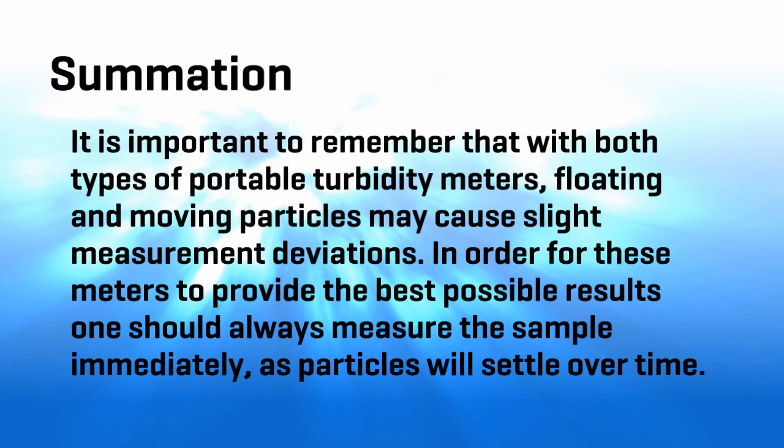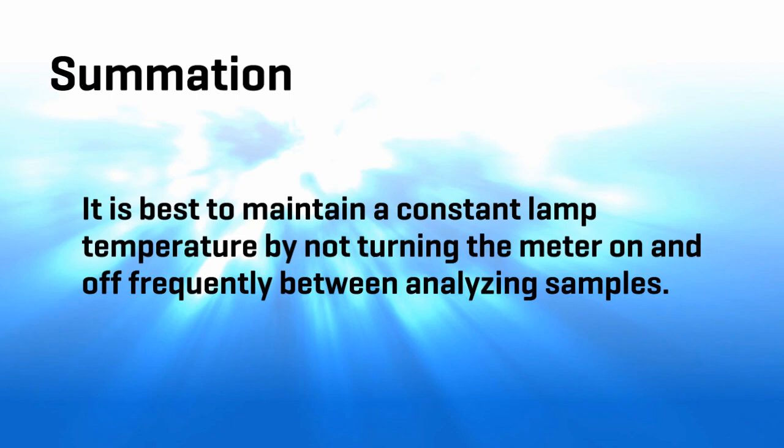We're also saying that it's usually best to test as quickly as possible. That's true. Things are going to settle out over time. And certainly if it's been sitting for a while, you're going to need to invert the sample a few times before you do the testing, because you need to resuspend the particles, because that's the way they were in the actual system. They're not all settled out in the system unless it's a dead line or standing water. But even so, there's still things floating around in it. So it's better, the quicker you take the sample, the more accurate it's going to be.